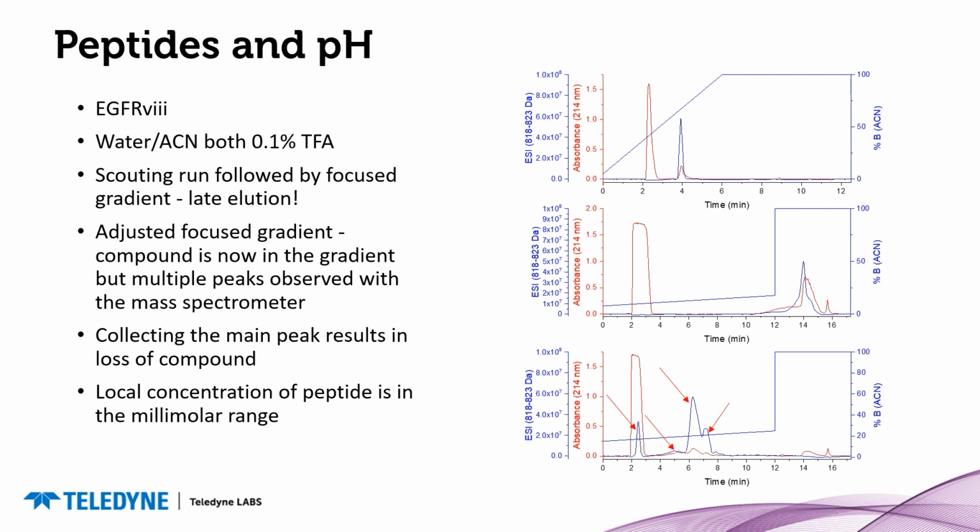This is because TFA is not a buffer in preparative HPLC. TFA is about 6 millimolar concentration at about 0.1%. For this run, 50 milligrams of peptide was injected with a mass of 1,635 grams per mole, which is 0.03 millimoles, which doesn't sound like very much. This is, however, ideally eluting in the volume of about 20 mLs or 1 fraction collection tube.